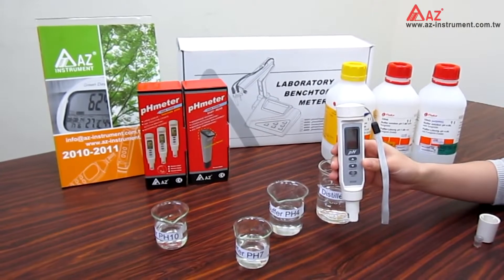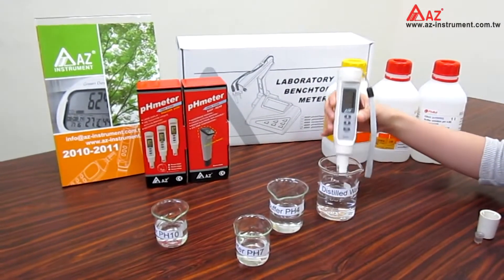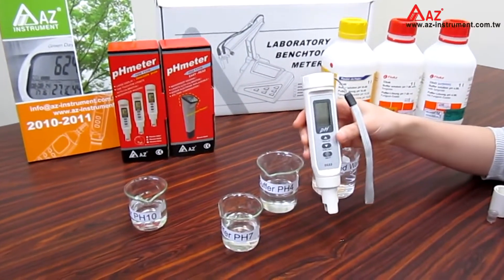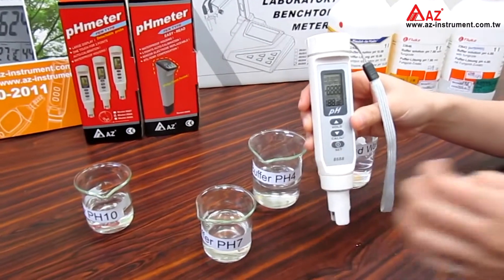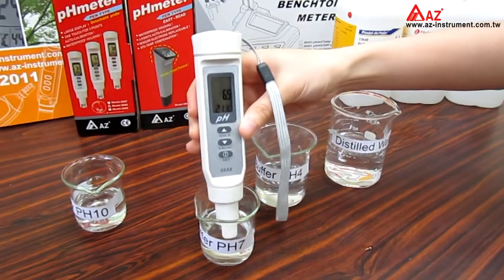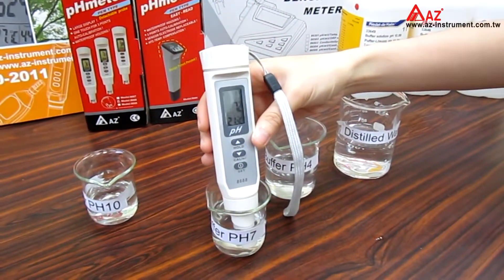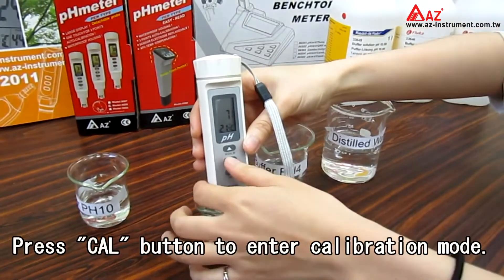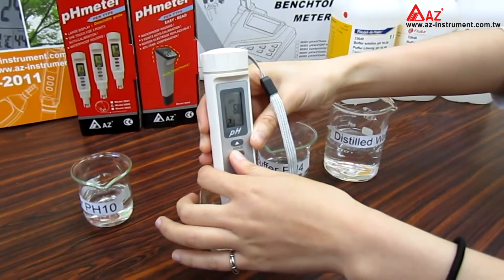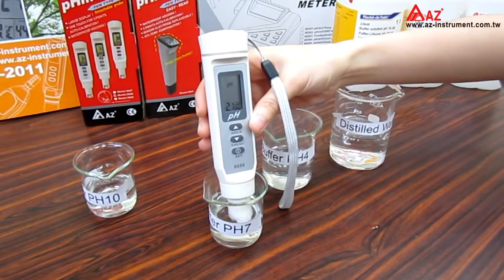Now let's start. Just rinse the electrode with distilled water to clean it. Then turn on the meter. Dip the electrode into the standard buffer and slightly stir. Then press the CAL button to enter calibration mode. You will see the CAL icon and pH reading blink on the LCD.